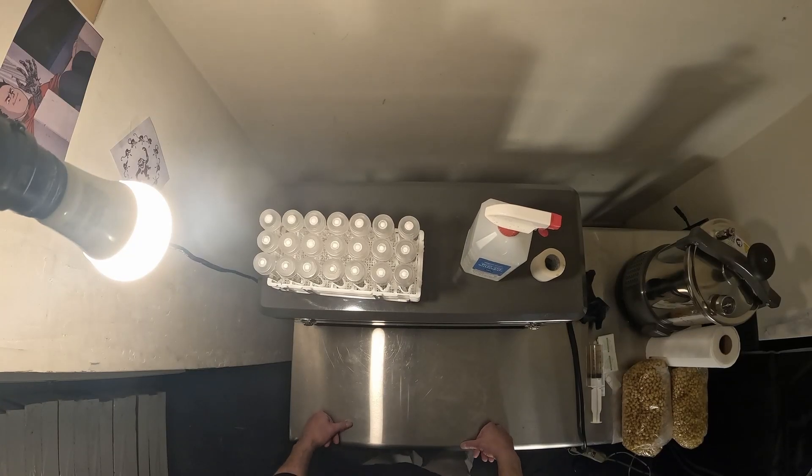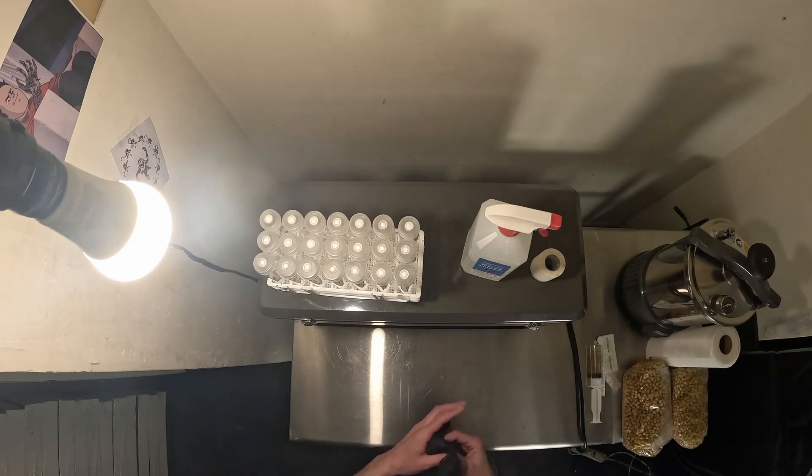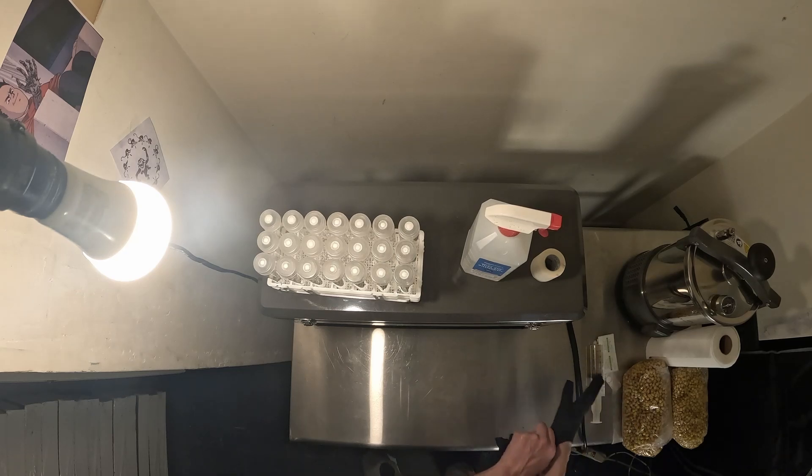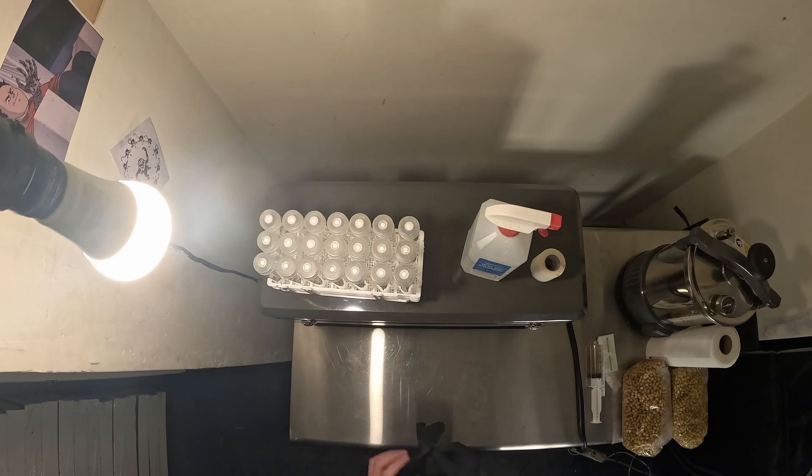Greetings and salutations, I'm Damien and this is the Athena flow hood tissue culture kit. I wanted to give you some of my opinions on this thing since I actually paid for it — I bought it off Amazon, it was about $2300. Well worth the money for me, I'm definitely happy with the purchase.